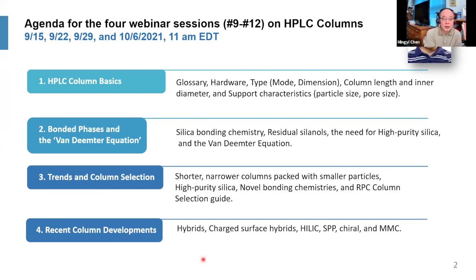Finally, in the 4th week, we can talk about some recent column developments, such as hybrids, charged surface hybrids, and HILIC. HILIC stands for hydrophilic interaction chromatography. Sometimes you do need it, but in most cases reverse phase is sufficient, and it's also the best and the most reproducible.